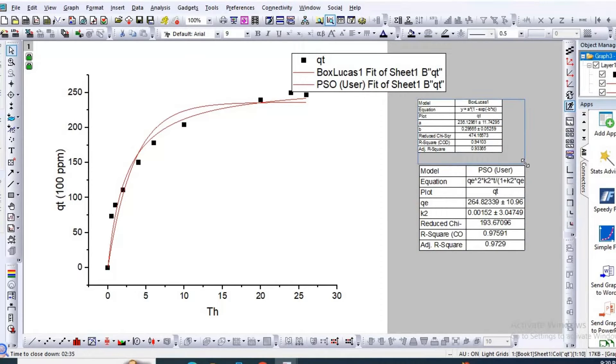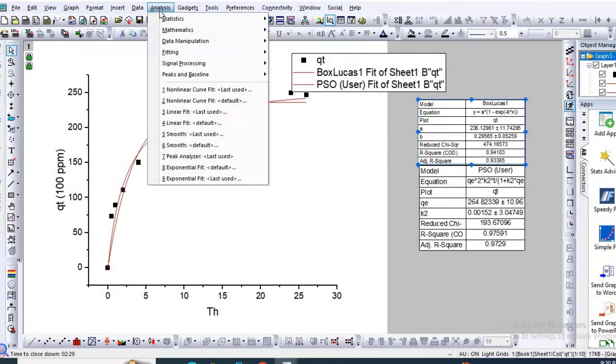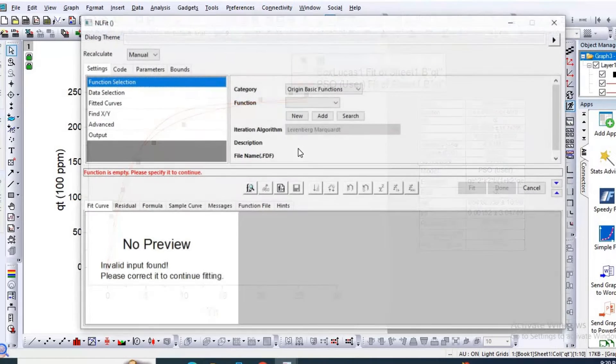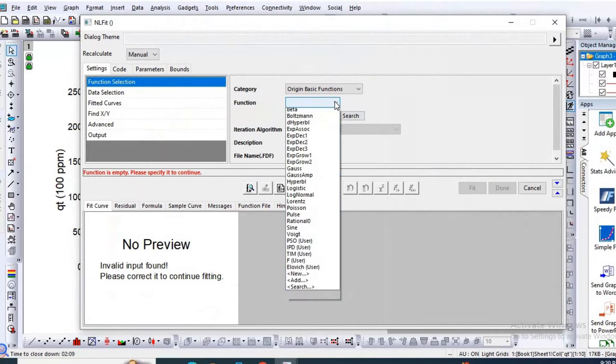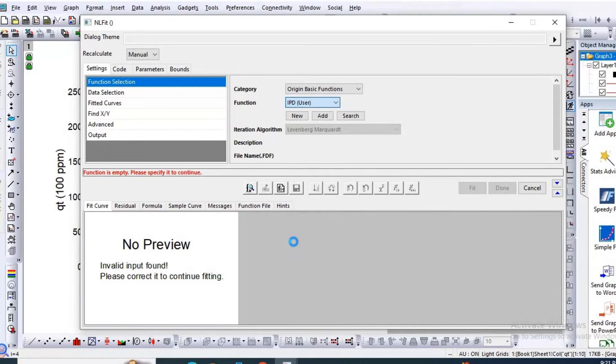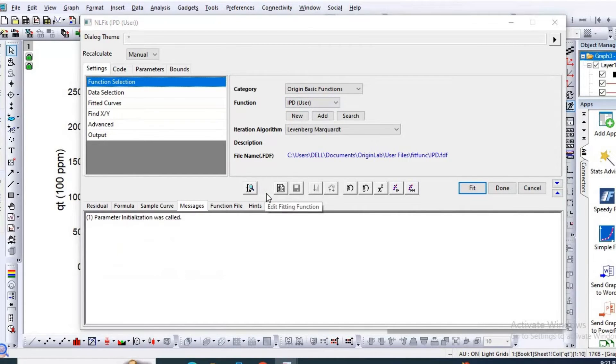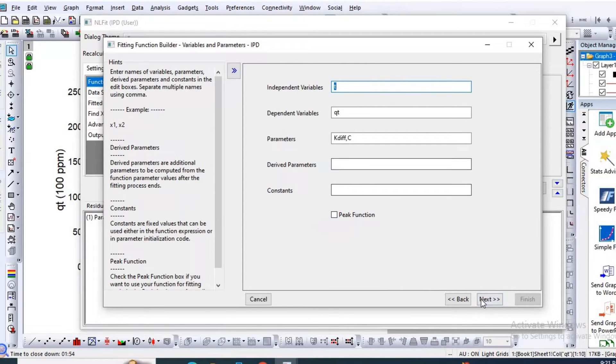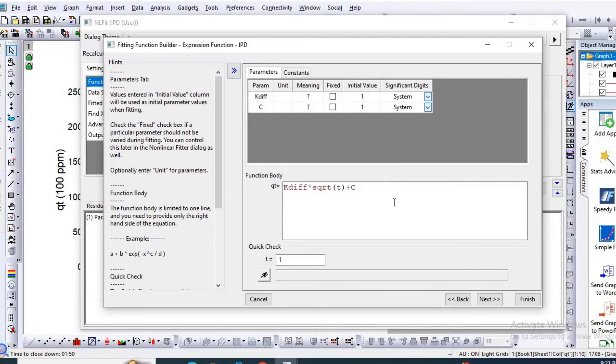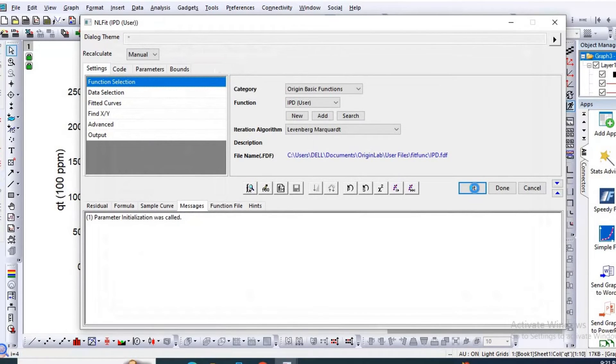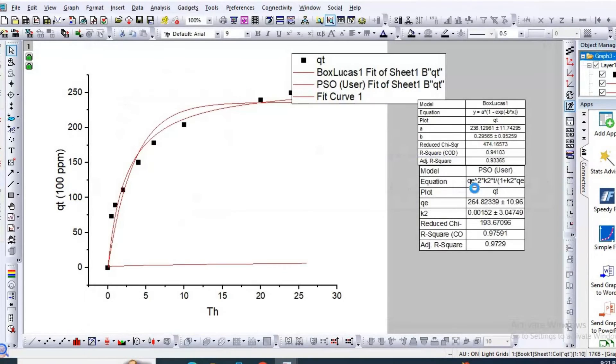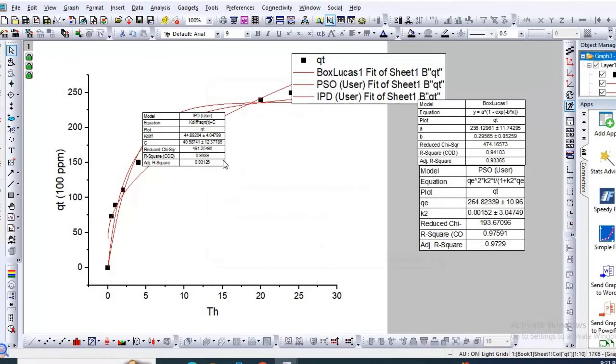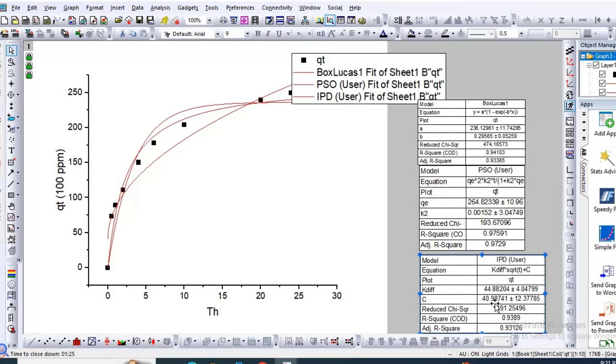Now I would like to fit intraparticle diffusion model. In order to fit, go to Analysis, then Nonlinear Curve Fit default. Then I have previously made intraparticle diffusion function builder. Let us see the function. Here is the function. I have previously built it. Finish then Fit. Then No, then OK. So here are the nonlinear intraparticle diffusion model parameters.